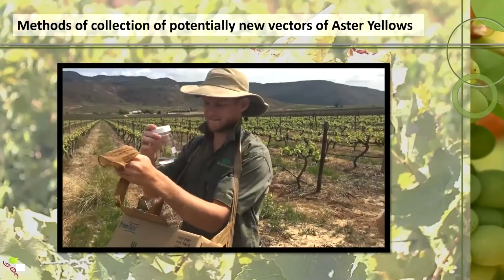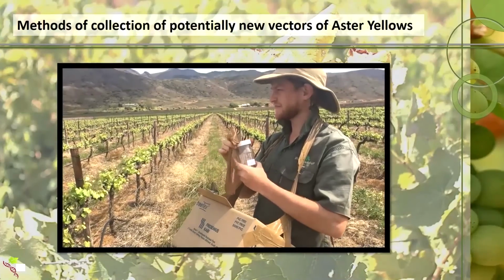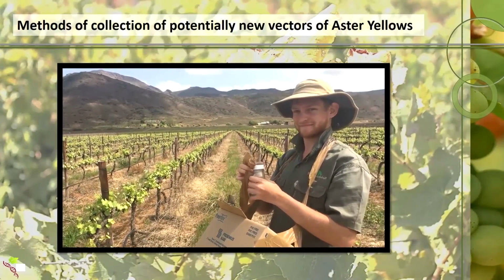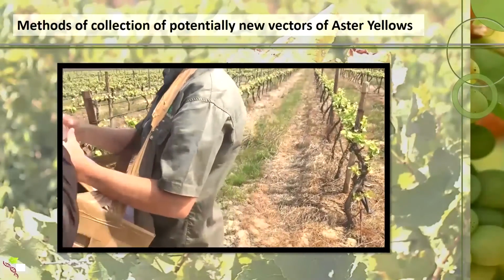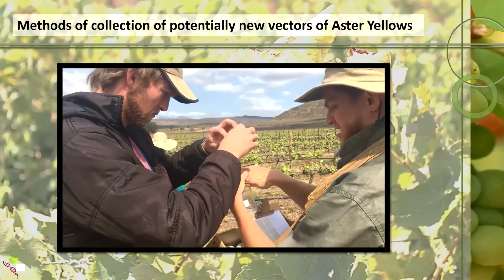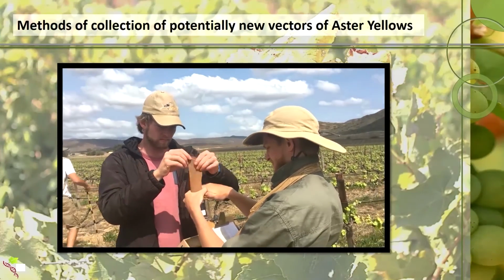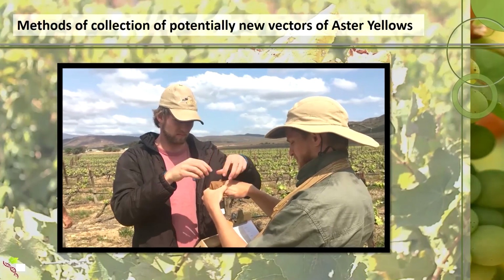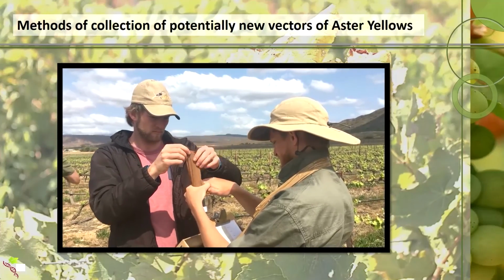A photograph is taken of the number of the accession. This would be directly after collecting, followed directly by the collecting of the plant material. And then the contents of the sock is poured into the alcohol to preserve any potential vector that might be there. These samples would then be taken to the laboratory and tested for the Aster Yellows phytoplasma.